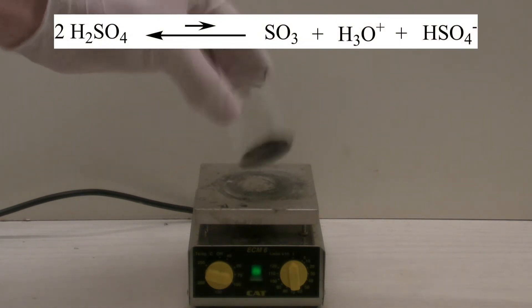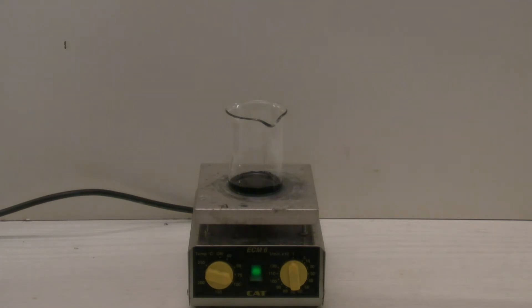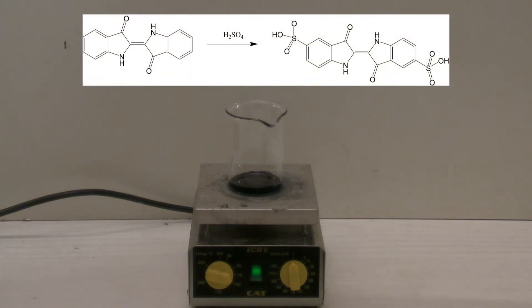Sulfuric acid is able to react with itself in an equilibrium reaction. This is called autoprotolysis, which can be used to sulfonate some substances even without sulfur trioxide, as for example indigo. Due to the sulfonation, indigo carmine should form.